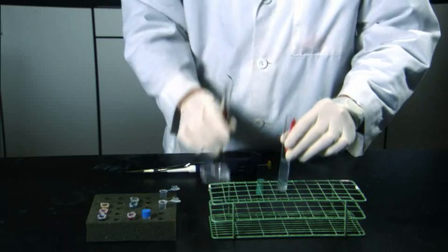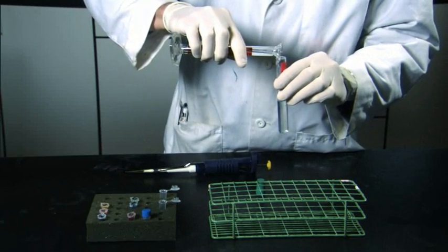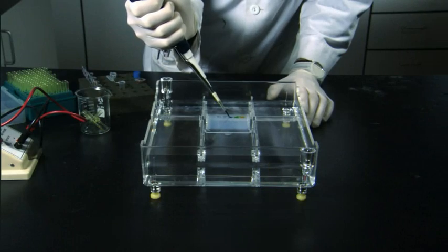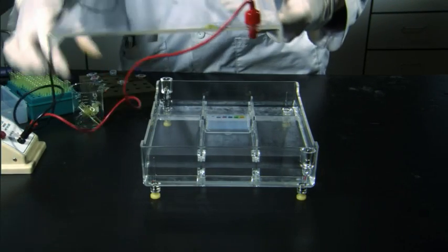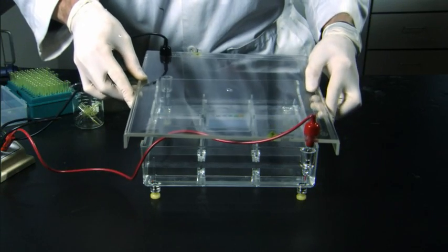First, enzymes are used to cut the DNA strands at specific locations. This results in DNA fragments of different sizes for different people. These DNA pieces are placed in a special gel, and an electric current is applied.